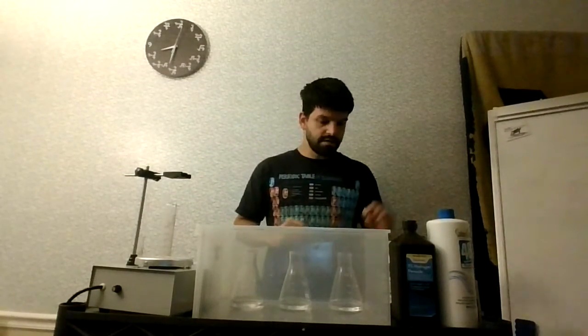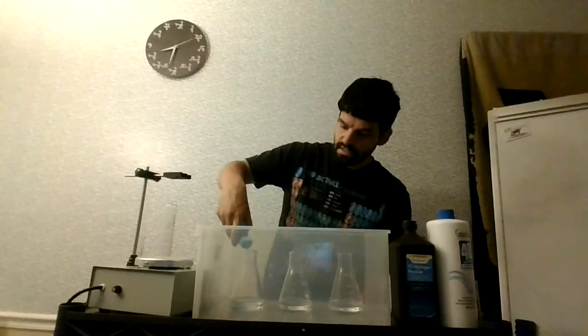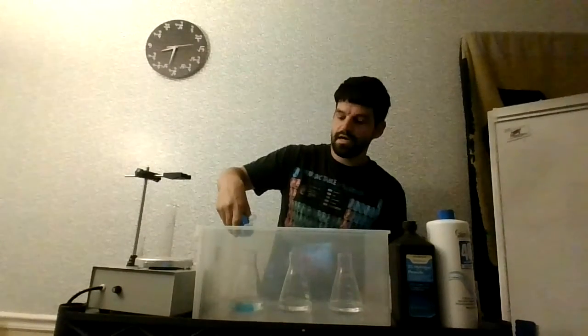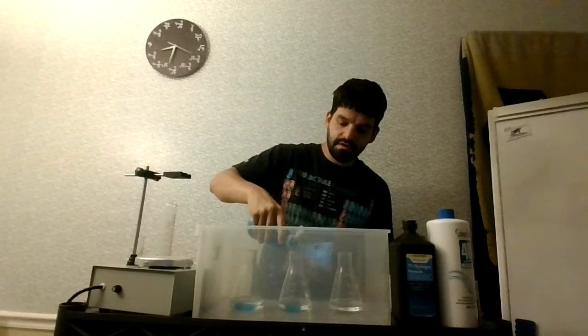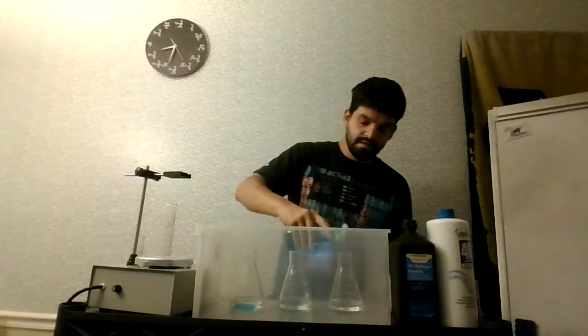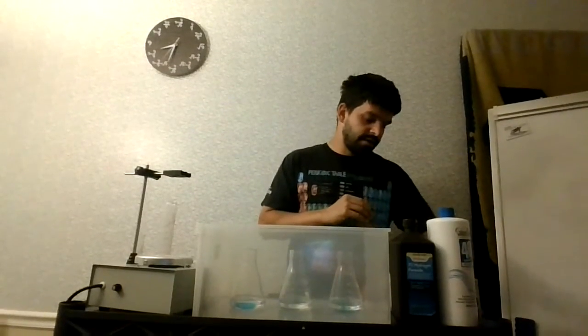So then what we're going to do is add our liquid detergent, or liquid dishwashing liquid, to all three of the vessels. And remember from last time we talked about how with the dishwashing liquid, it's not so much the volume that is important as what it's physically doing as part of the experiment. If you try to put it on a tablespoon to measure out the 1 tablespoon that you need, most of it's going to stick to the spoon. So you can eyeball it and it won't have a drastic setback on your experiment, okay?